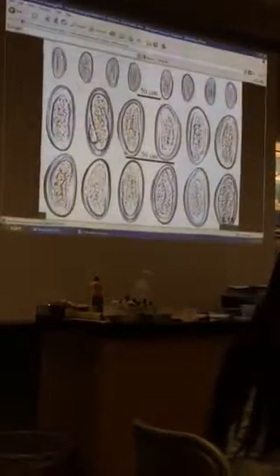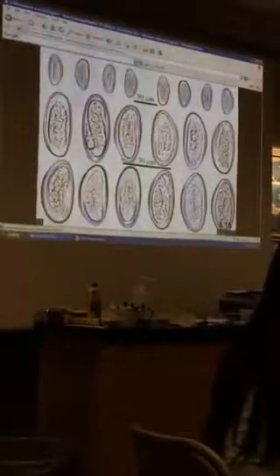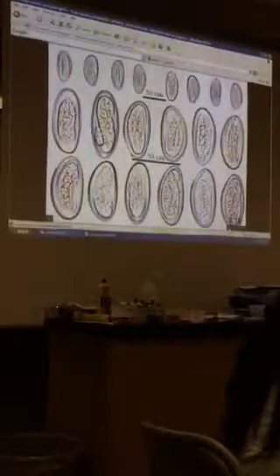Okay. Here are Enterobius eggs. They're pretty small. This is a 50 micrometer bar. The shell is almost transparent. You've got a little nematode larva, and it's kind of bent over in half, so it makes a line down the middle where the worm is bent over and touching itself. That helps to make them look very characteristic. You'll have a hard time missing Enterobius eggs if you look at a couple of them.